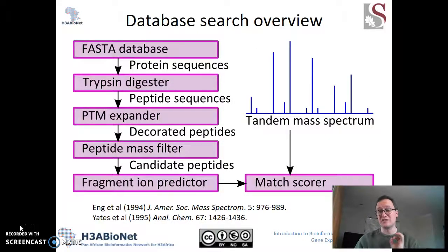So the database search algorithm is kind of the key piece of the intellectual property of bioinformatics for proteomics. We start by looking up the answer in the back of the book. In other words, we're going to start from what list of proteins are possible for the species that we digested up to produce this set of tandem mass spectra. So if we started with a clinical sample, we're going to start with a human proteome, the full set of all human proteins that we know to exist.